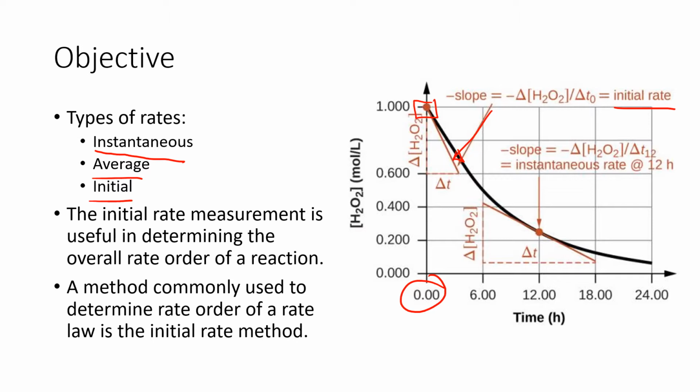So as soon as the reaction starts, the timer goes off, and then you watch the reaction happen, and you basically measure that rate. Now, this isn't for the entire reaction overall, right? But this does give a lot of information overall. That's initial, and you'll see right now what type of information we can calculate.